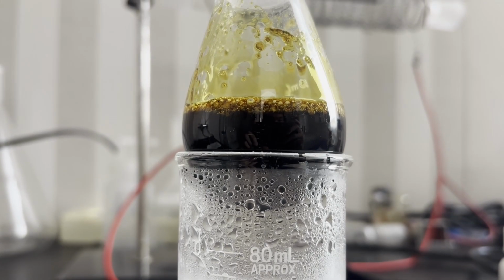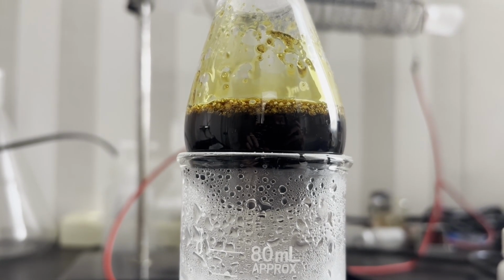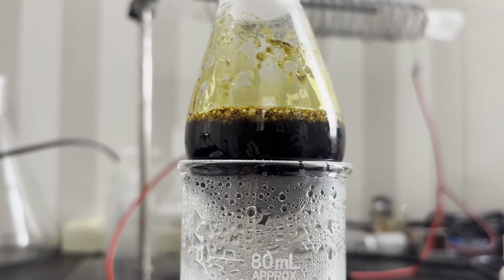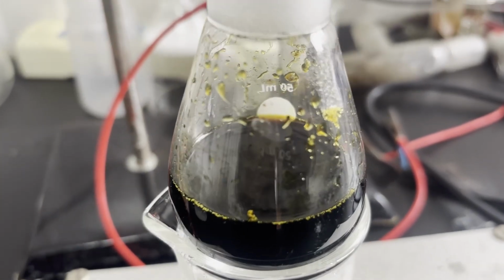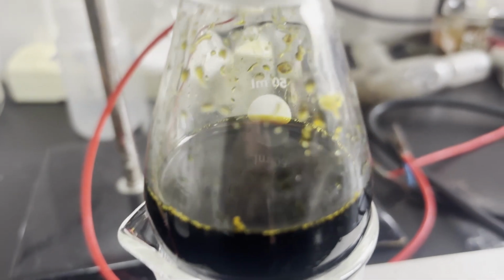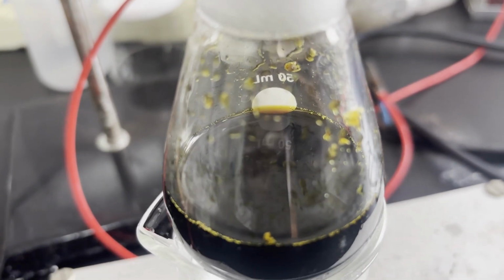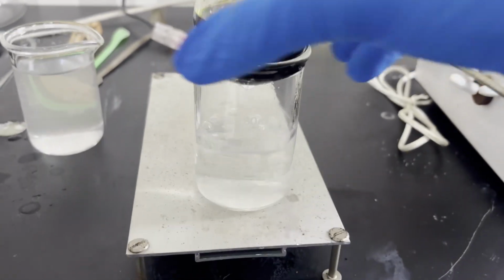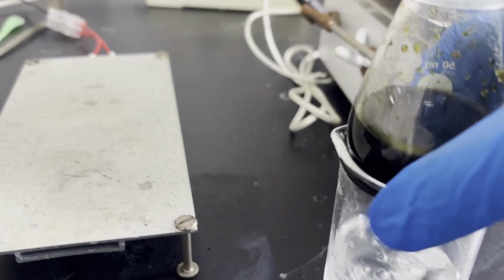The Organic Syntheses procedure required 4 hours of heating and obtained a yield of 91 to 96%, but the paper I'm following only needed 1 hour and apparently also had a decent yield of 80%. Since I'm rather short of time, I decided that a slightly lower yield is acceptable. After an hour, the color of the mixture changed to have a slightly greenish tint, and the heating is removed.